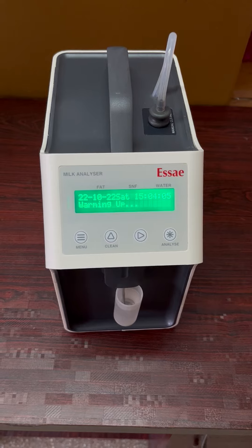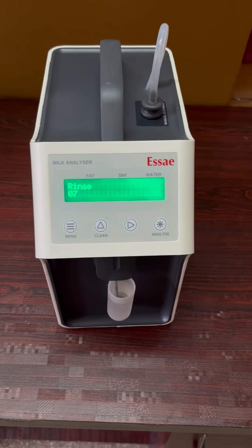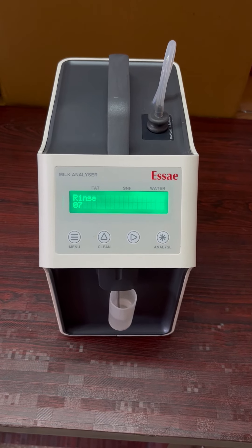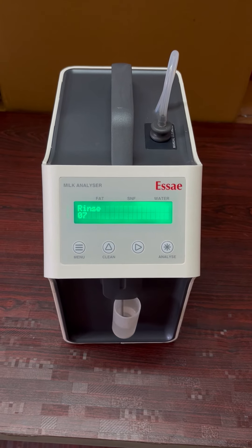This is the 4-shift backup. This is the charge module.